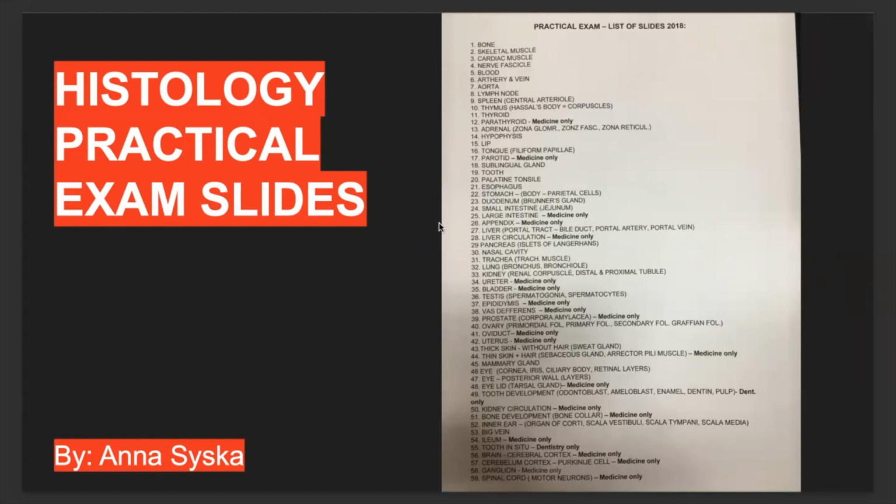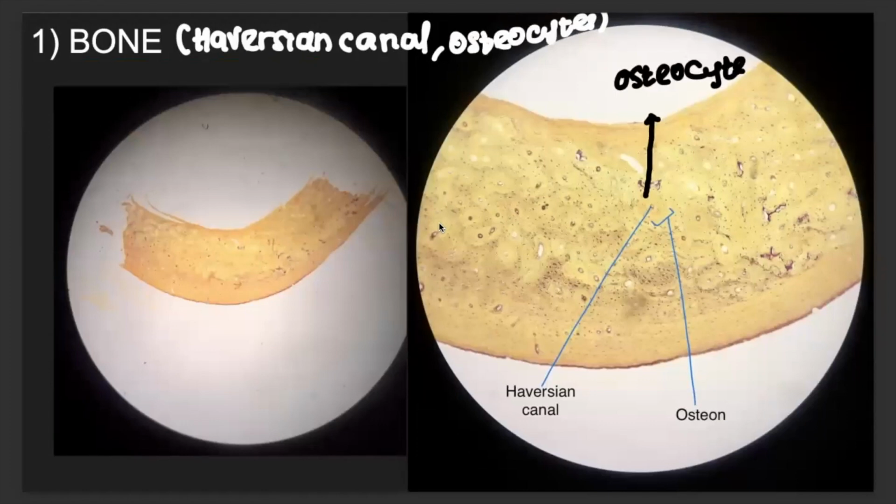Today, I just wanted to drop in and post the slides for the practical exam for histology. Hopefully, you guys would use them for your exams, and this includes probably both medicine and dentistry. These are the slides, and so we're going to start with bone.